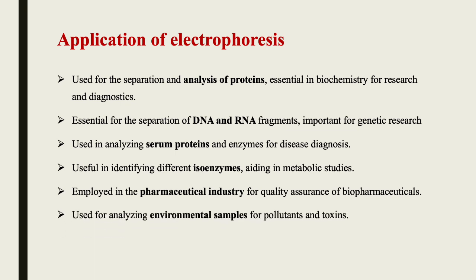The sixth application is to analyze environmental samples. Suppose in the atmosphere you have different types of pollutants mixed, and you want to analyze those toxins or pollutant chemicals. For that also you can use electrophoresis techniques. So these are the six applications of electrophoresis.